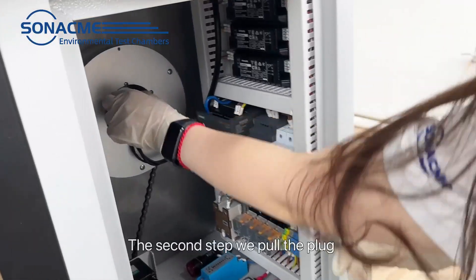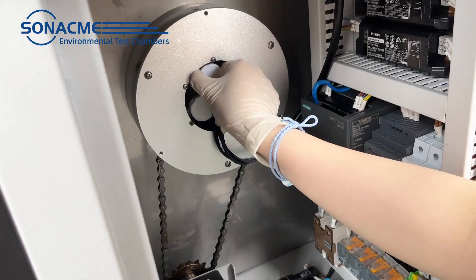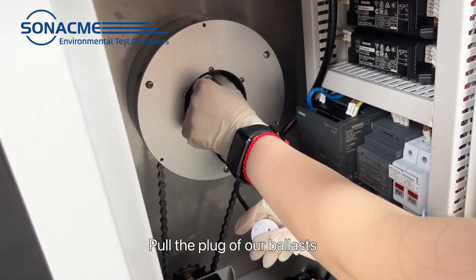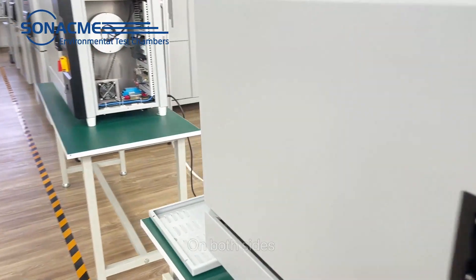The second step: we pull the plug — pull the plug of our ballasts — on both sides.